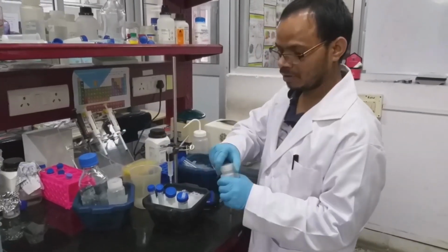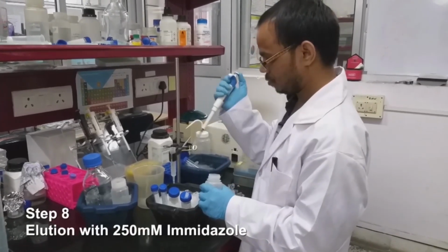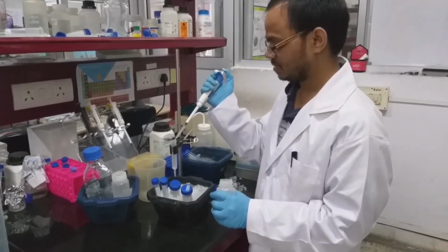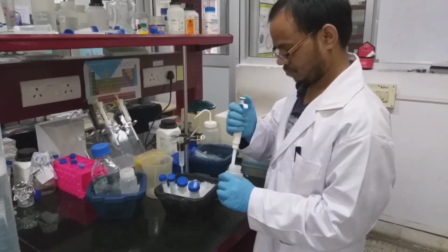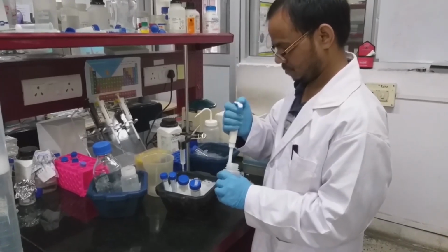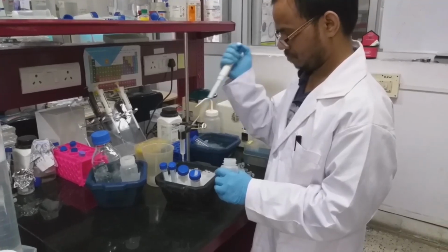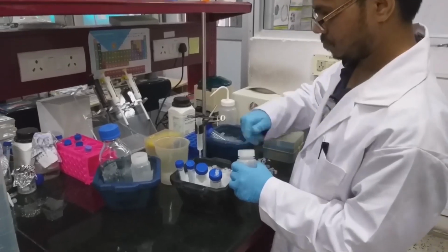In the final step, we are going to elute with the 250 millimolar imidazole containing buffer. What we are going to do is incubate the beads with this buffer for some time and collect the fractions. Now we have to collect the fractions.